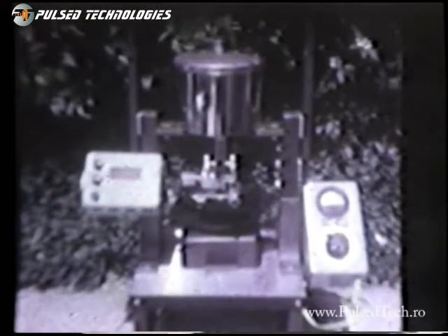And this is another external view of the projection microscope with a 6-inch barrel, which has locations at the top of the barrel for 3 eyepieces or a camera, which can be inserted, and the images reviewed or seen.